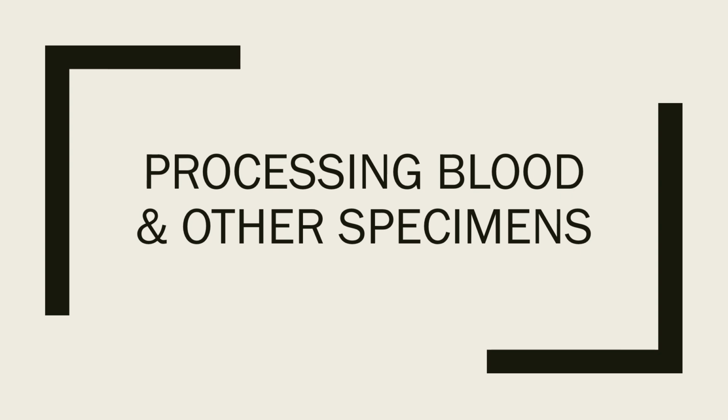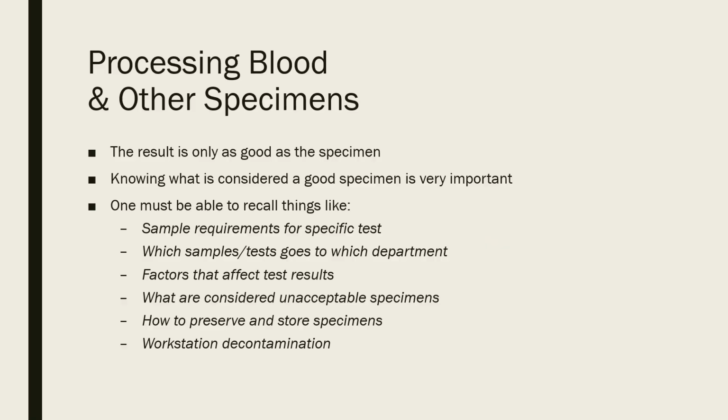This lecture will cover processing blood and other specimens. So again, I'm going to put my motto out there. The result is only as good as the specimen.